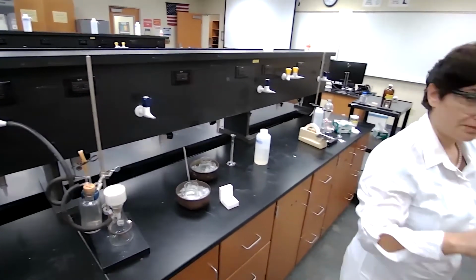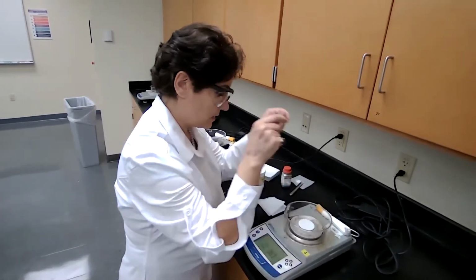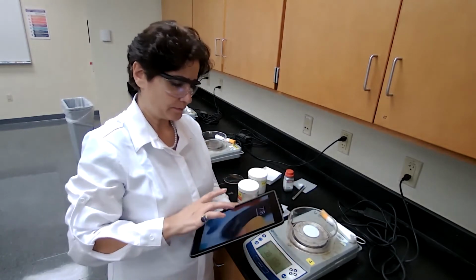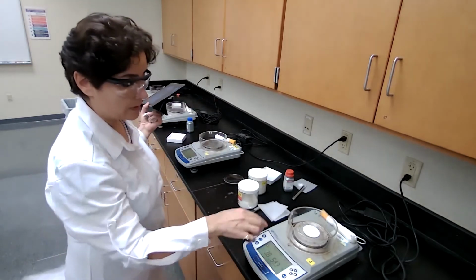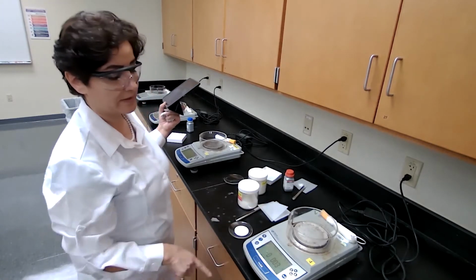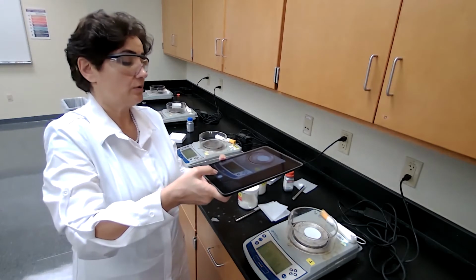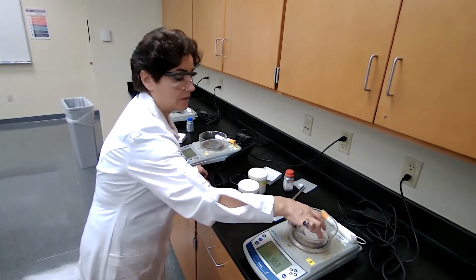So let's record the mass of the watch glass with the filter paper using the scale. Make sure it's tared so it doesn't show any mass, it's 0. Place the watch glass with the filter paper. As soon as it's stabilized, we are going to record that number. Now we have the mass of the filter paper.